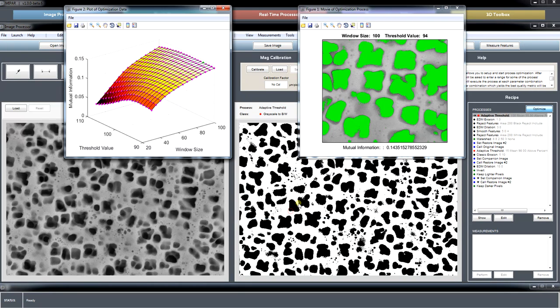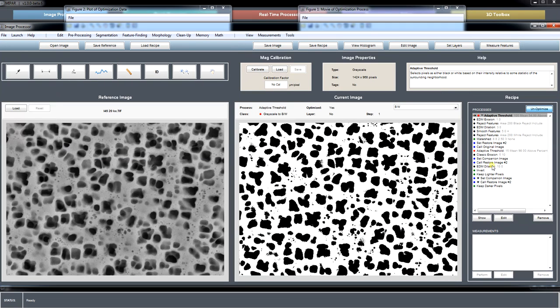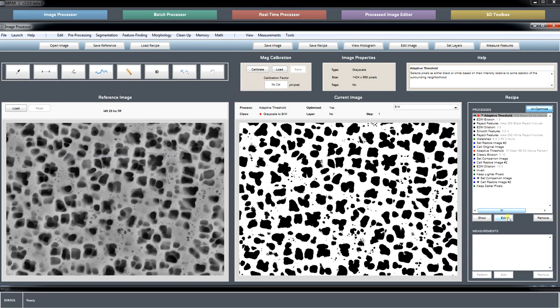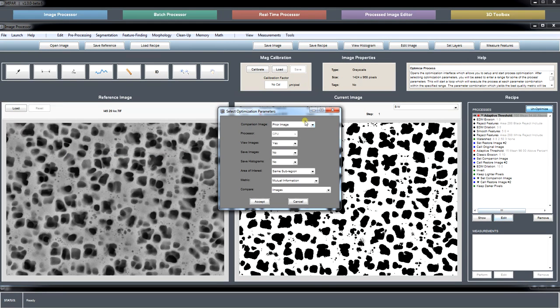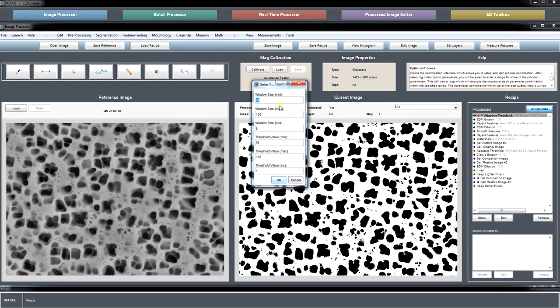If, let's say, I hit accept, what would happen is that, of course, the rest of the steps get automatically redone. And I'll just show you, for the sake of proof, that if I kept all these the same, but now let me take the window size from 100 to 300, and I'll double this so that it runs quicker, and I'll set this at 50 so it runs quicker.